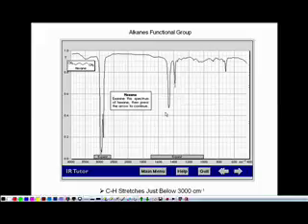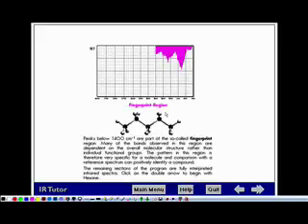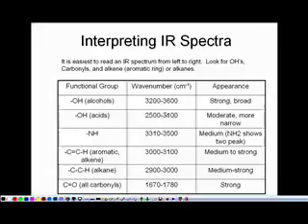So if we summarize then all of the infrared region that's important to us, here's what it is. We look for alcohols at 3200 to 3600. They tend to be strong, broad peaks. Acids will show up closer to 3000. NHs show up between 3300 to 3500, but they're medium-sized peaks, with an NH2 being a sort of double pair. Then peaks above 3000 are double bonded hydrogens. Peaks that are just below 3000 are alkanes. And then carbonyls show up from about 1600 to 1800.